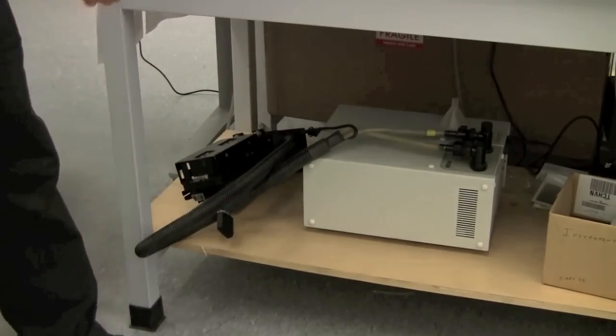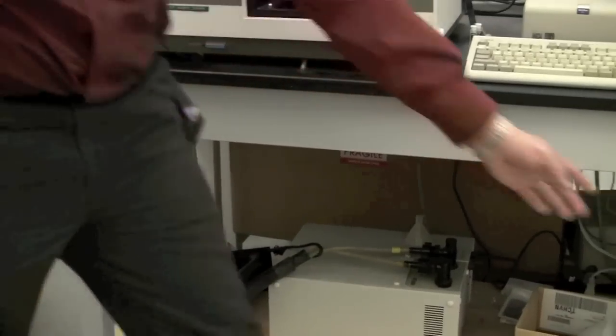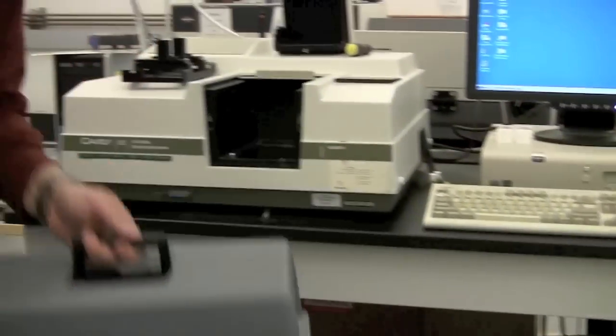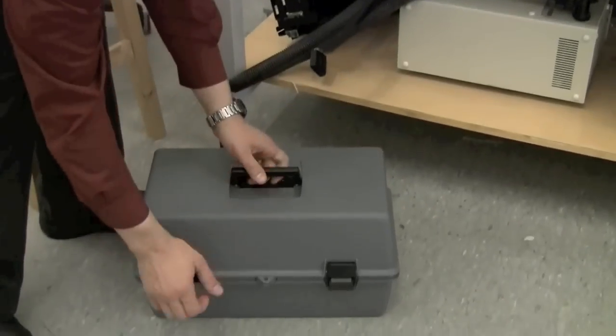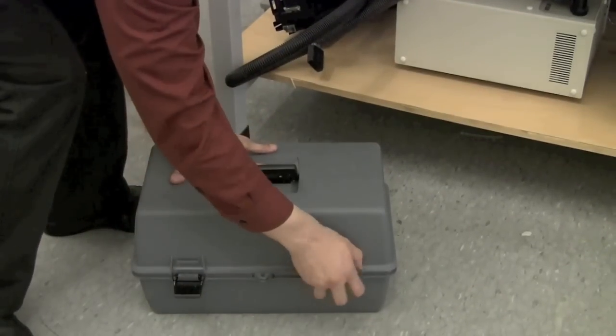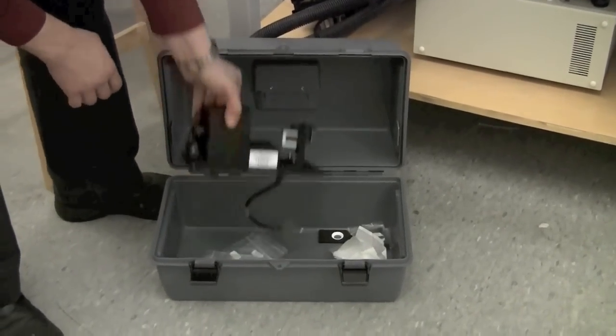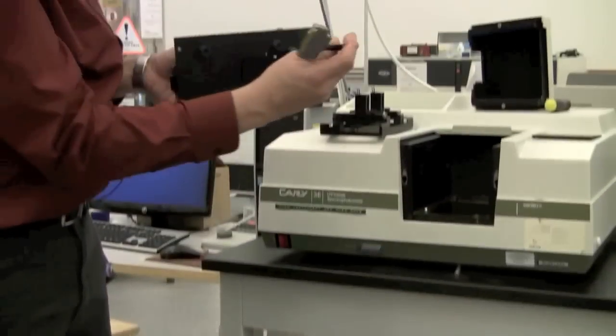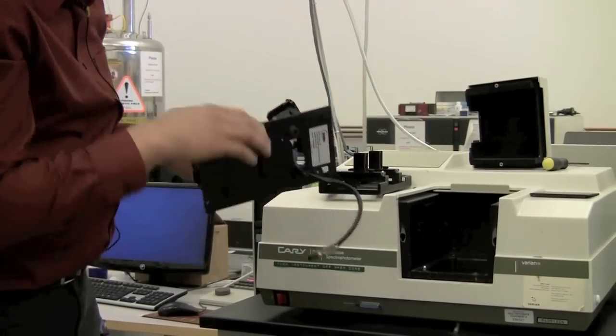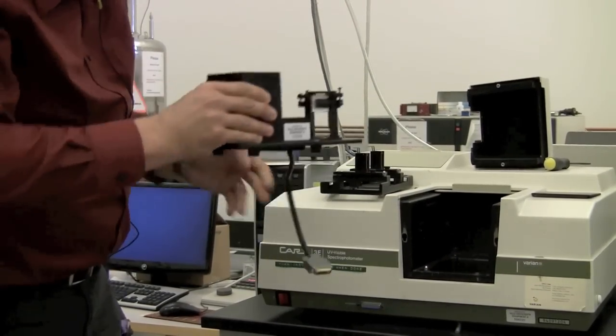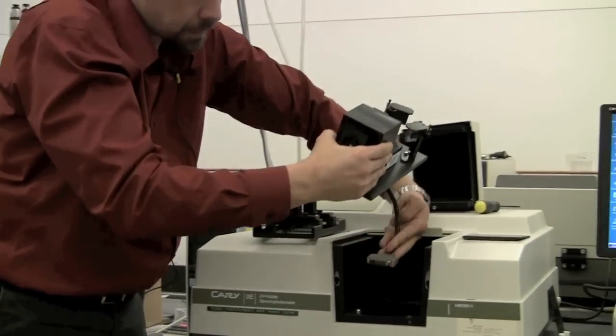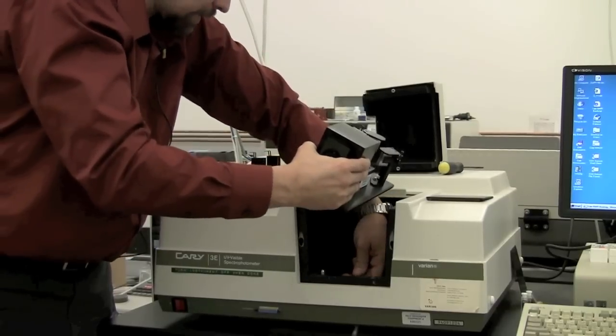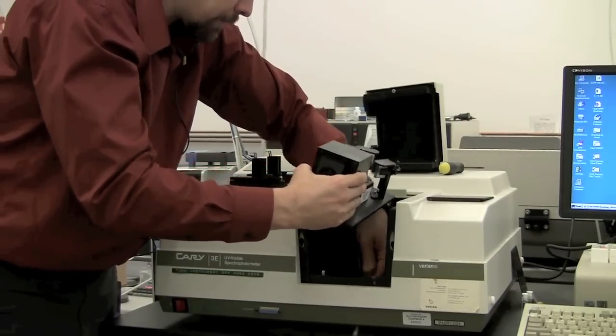We have another accessory, which is the Integrating Sphere. That's stored in this black case right here. To load the Integrating Sphere, it has its own detector, which is sensed through this cable here. To connect that cable, it connects on the front, not on the bottom as the sample changer does. So you want to plug it in on the front.